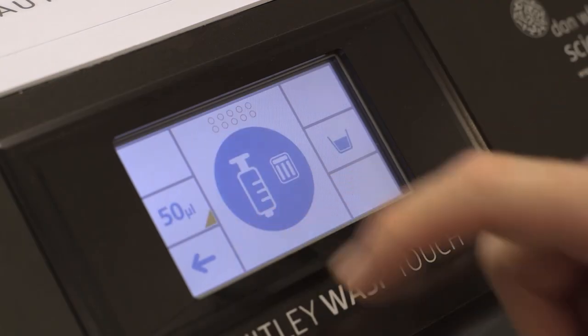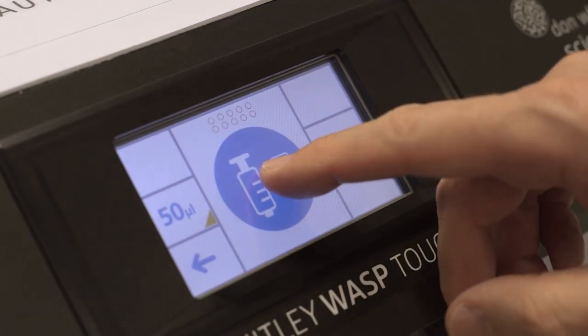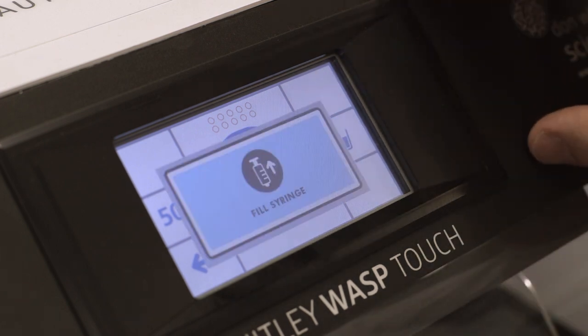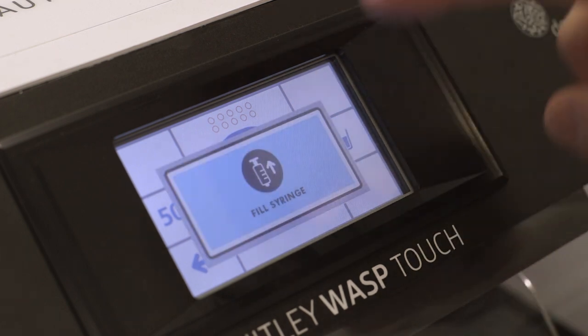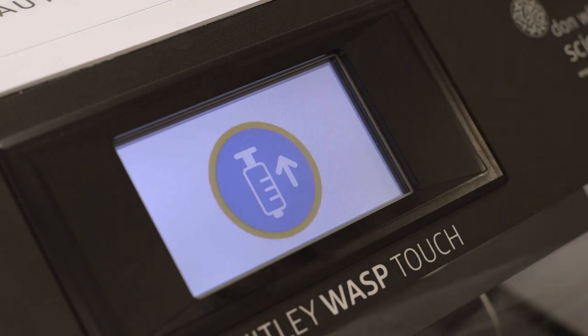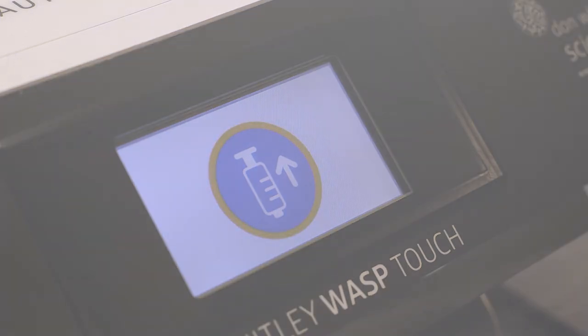Wasp Touch now includes a calibration routine that makes verification of dispensed volumes simpler than ever. On-screen prompts guide the user through each step, safeguarding accuracy and reproducibility.